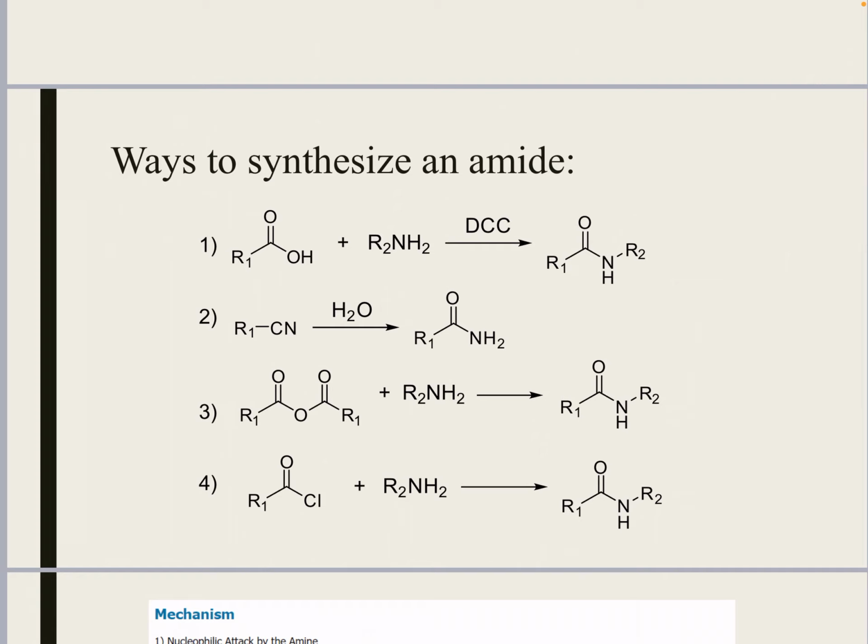The third reaction is the one we use today, which is that we start with acetic anhydride to react with an amine to form an amide. You may either use catalysts or not. There are several different catalysts you may choose from. Aluminum oxide was the one we chose for today's reaction, but some other catalysts were also available for the reaction. If you do not use any catalyst, the reaction will go very sluggishly. Sometimes it will take overnight for it to complete.